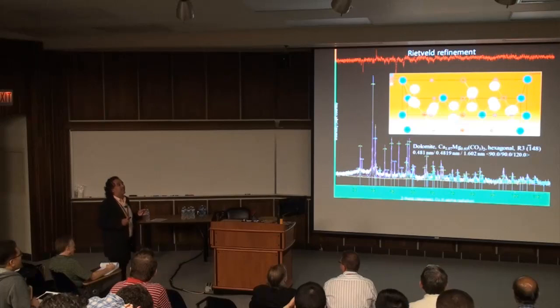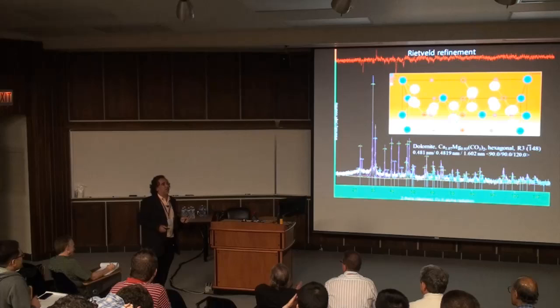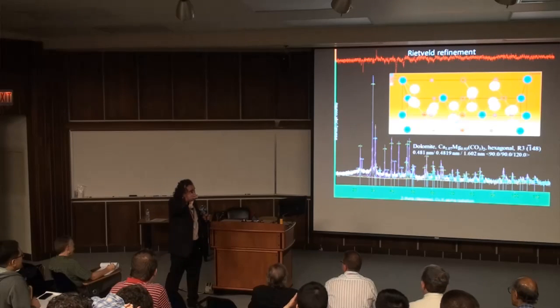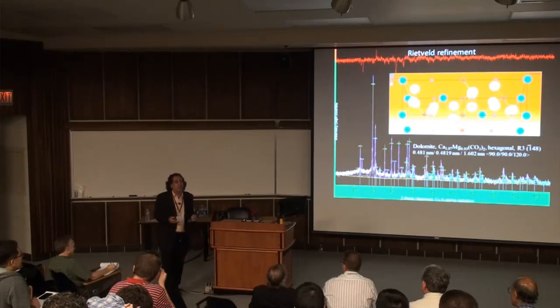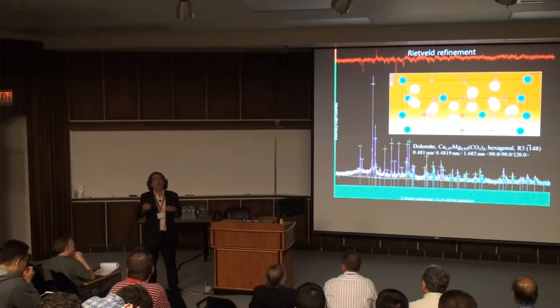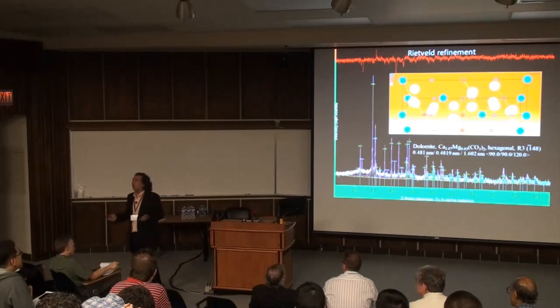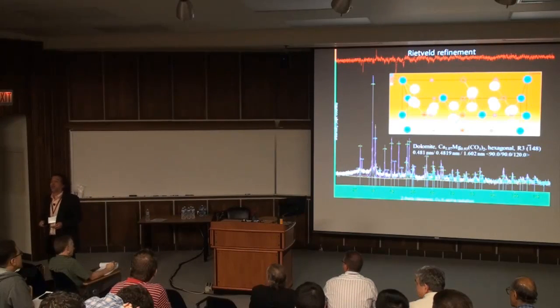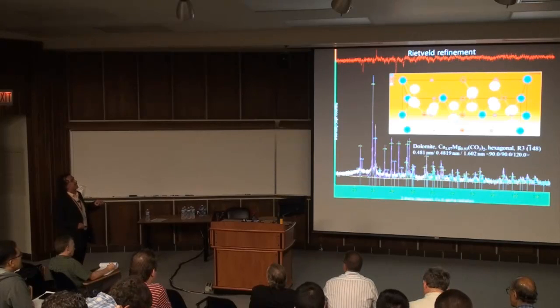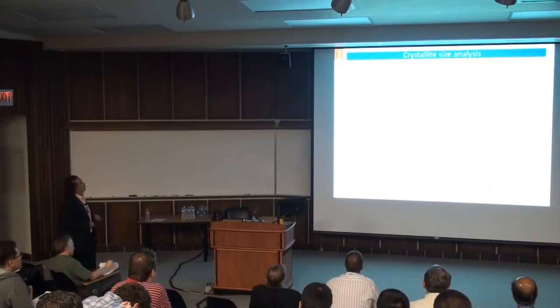You have heard of the thing, how do I put it in a way that's not going to be censored in the video? Crap in, crap out. Right? So if you have bad data acquired with very poor statistics, the software will fit and you crank out wrong numbers that are not physically possible. If you want to do Rietveld, you have to be able to invest the time to acquire good data. But it pays off in the long run, because you get very accurate information.